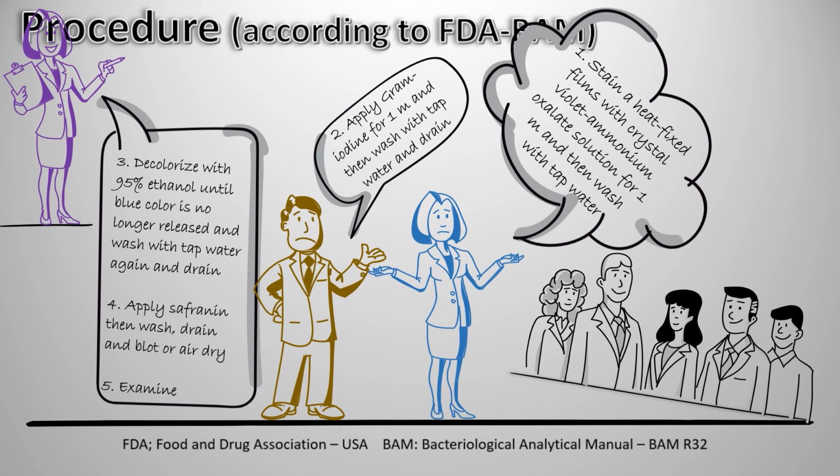Two things you have to understand: do not use too much crystal violet in the first place, because this will mask the whole thing.